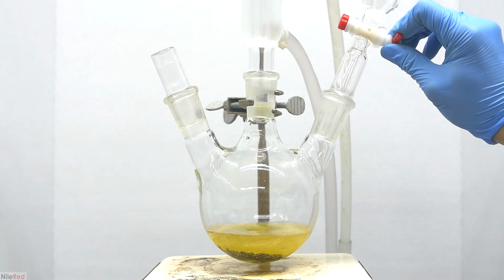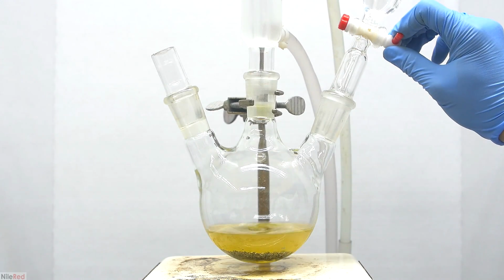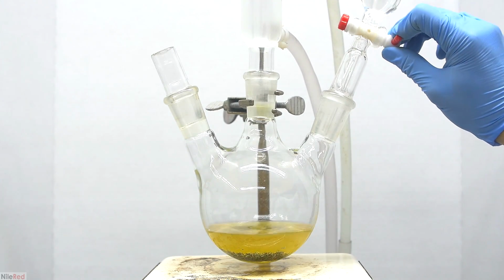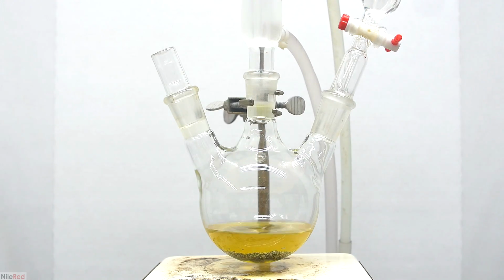I mentioned just a minute ago that Grignard reactions can be annoying to start, and I guess I'm having some troubles here. I decided to just keep adding more 1-bromopentane in hopes that the reaction would start. Eventually, I got to the end of the 1-bromopentane, and I was very sad to see that still nothing was really happening.